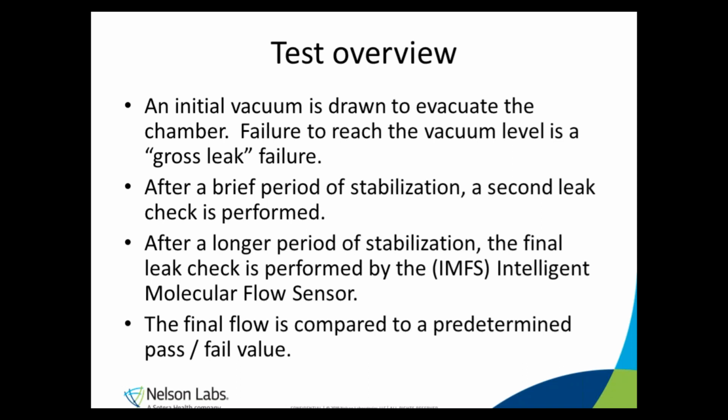This is, again, a step mainly designed to protect the instrument from moisture contamination. Then we have a stabilization phase. For our vial example, this portion of the test represents about half of the total test time.